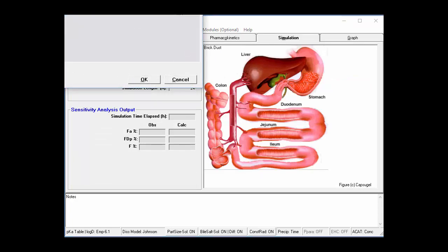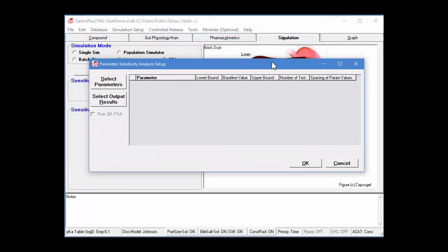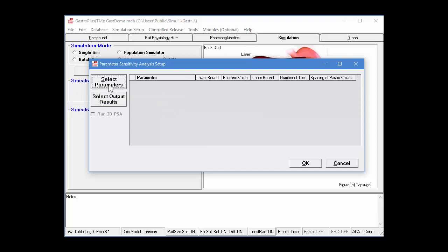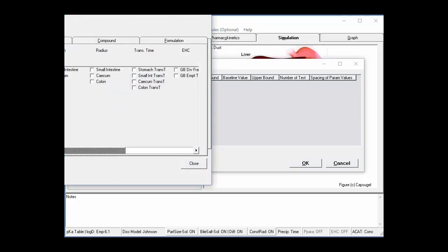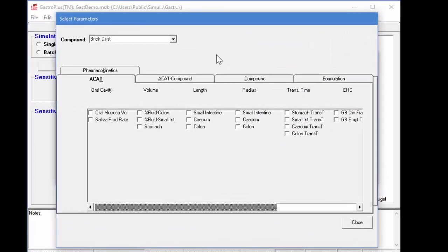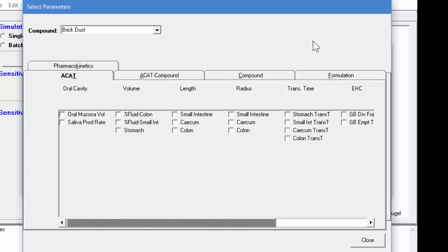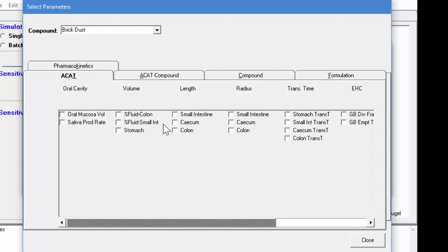So now let's pop back into the simulation tab. If we click on PSA, that will bring up a dialog box where we will have the values of the parameters to modify. First, we would click on select parameters and then modify or select the parameters that we want to look at. So this slide has several tabs that I discussed within the slides. And then under each tab are things like oral cavity, volume, length, radius, transition time, and enterohepatic recirculation. And then values that you can actually click on and modify.